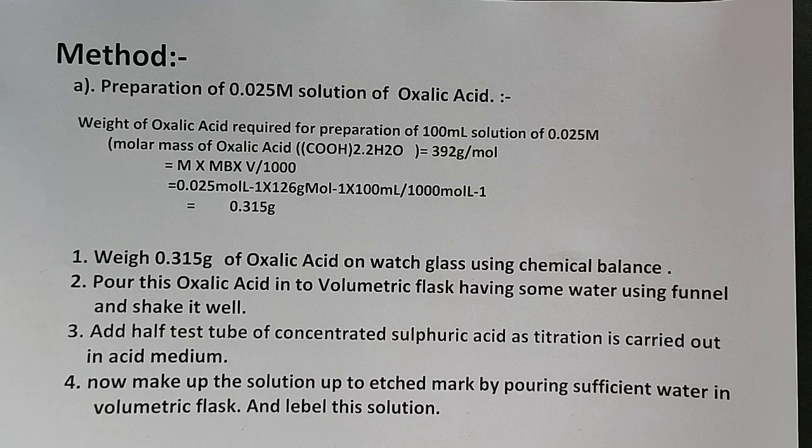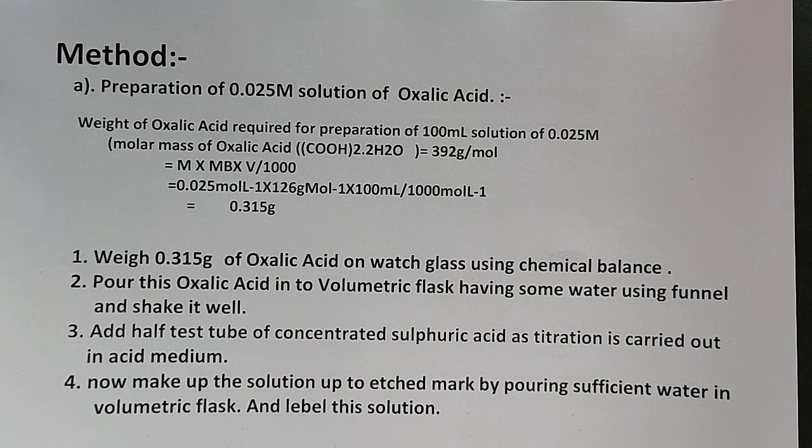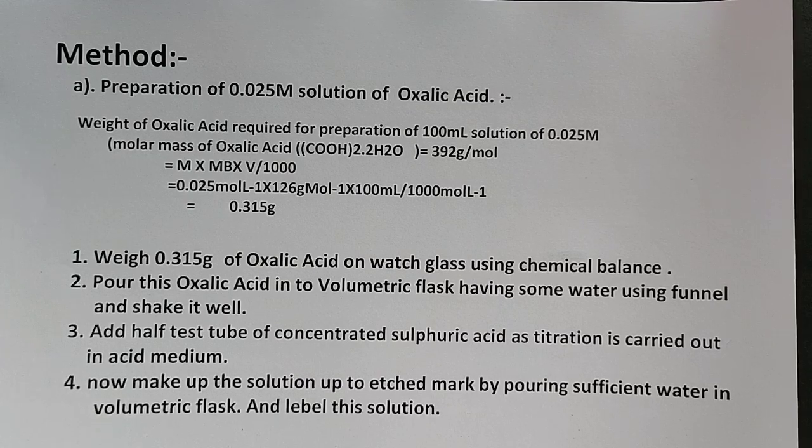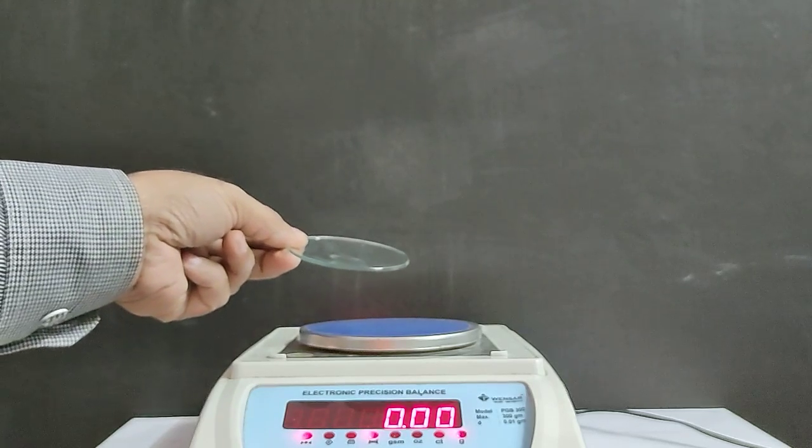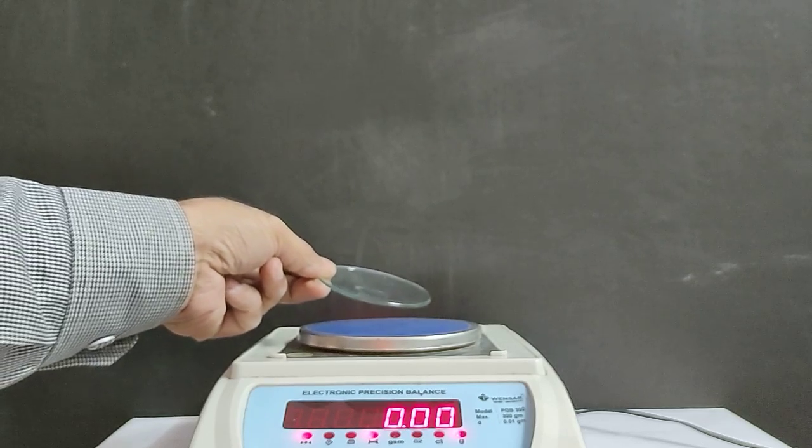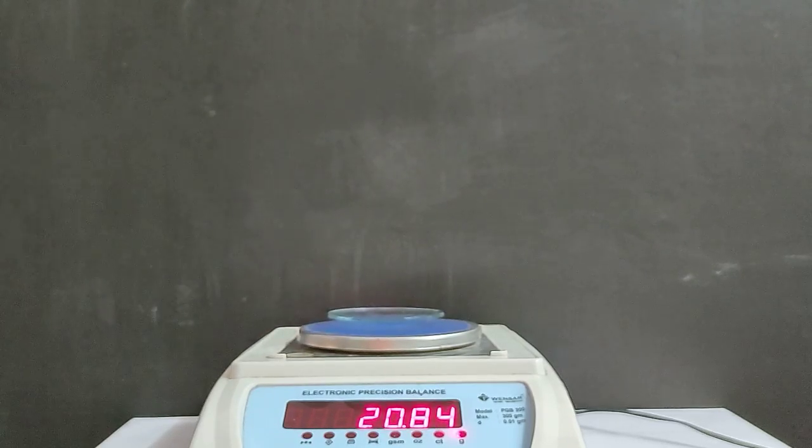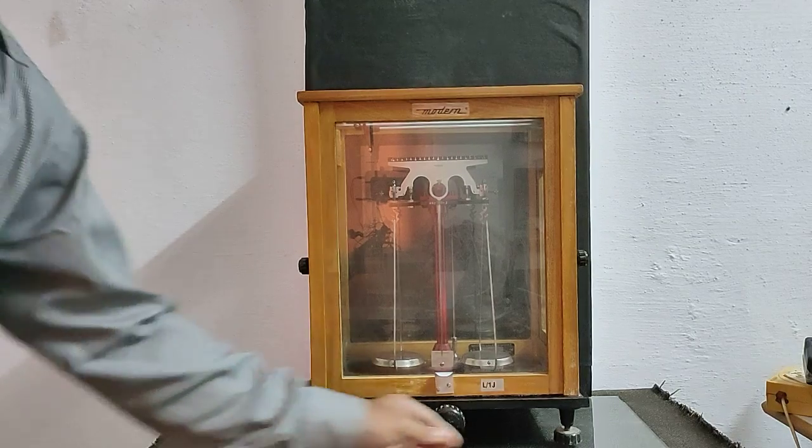That is coming 0.315 gram. So we have to weigh 0.315 gram of oxalic acid using chemical balance. Find the weight of watch glass by rough balance, and it is coming 20.85 gram.